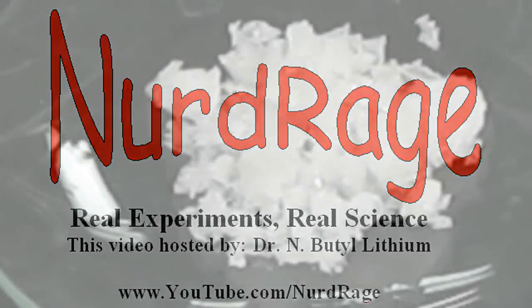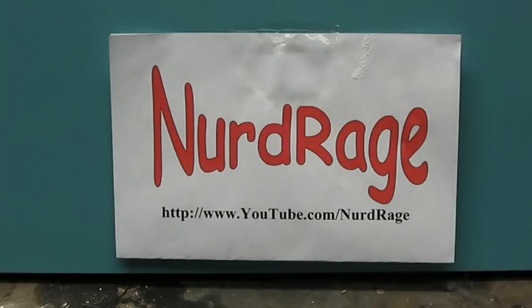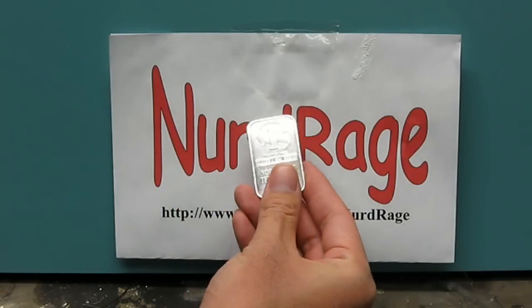Greetings fellow nerds. In this video we're going to make silver nitrate, a useful chemical in some of our videos. First, we need silver, so we'll be using this pure silver bar.